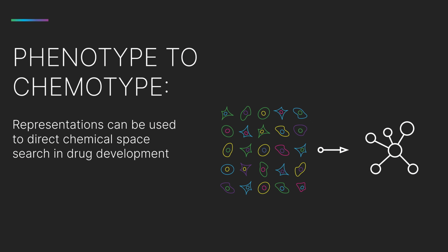We've now seen that representations of small molecules and gene knockouts are functionally meaningful and can be related to each other. One immediate outcome is that we can identify compounds that match or oppose phenotypes of specific gene knockouts, rapidly providing hit compounds for phenotypic states of interest. This is a massive leap forward from single target screens of compound libraries because of two fundamental advantages.